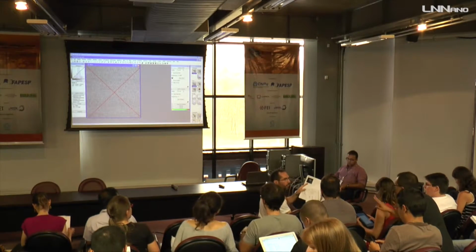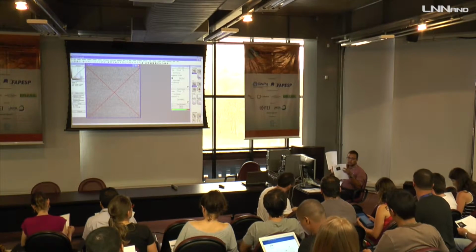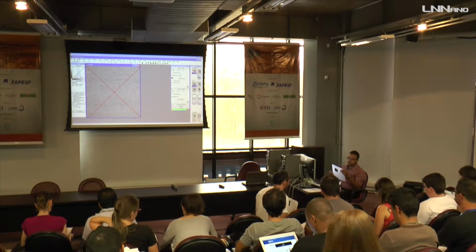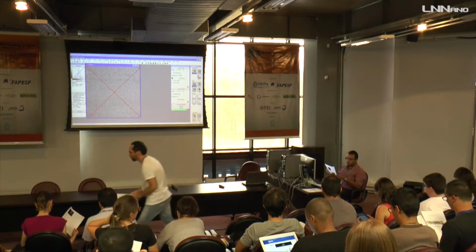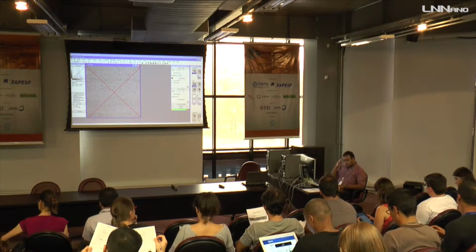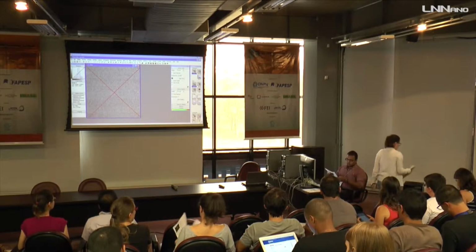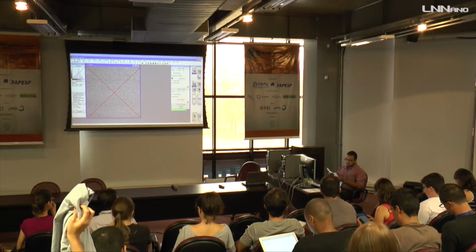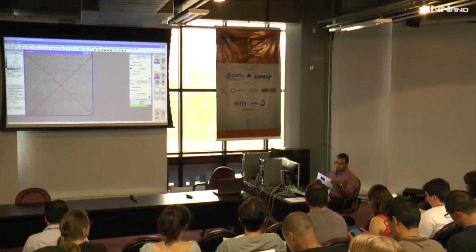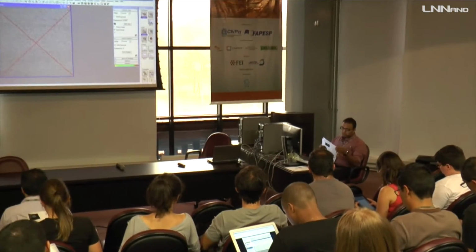And I believe everyone has got these two handouts. One is the presentation copy, and the other one is how to index a spot diffraction pattern. It's specially prepared only for cubic and for the silicon lattice. If you want to use this for a different crystal, you need to make some changes, such as in step 3, the interplanar spacing. That really depends upon cubic crystals only.